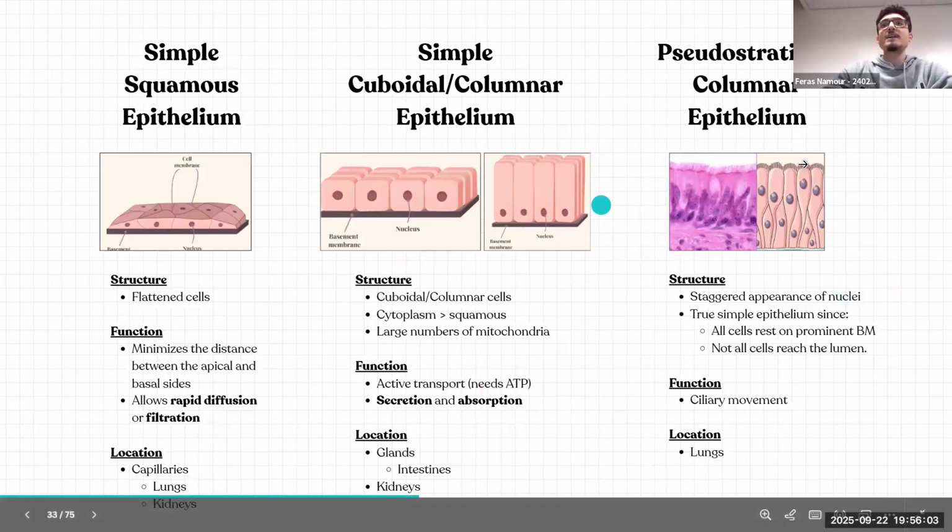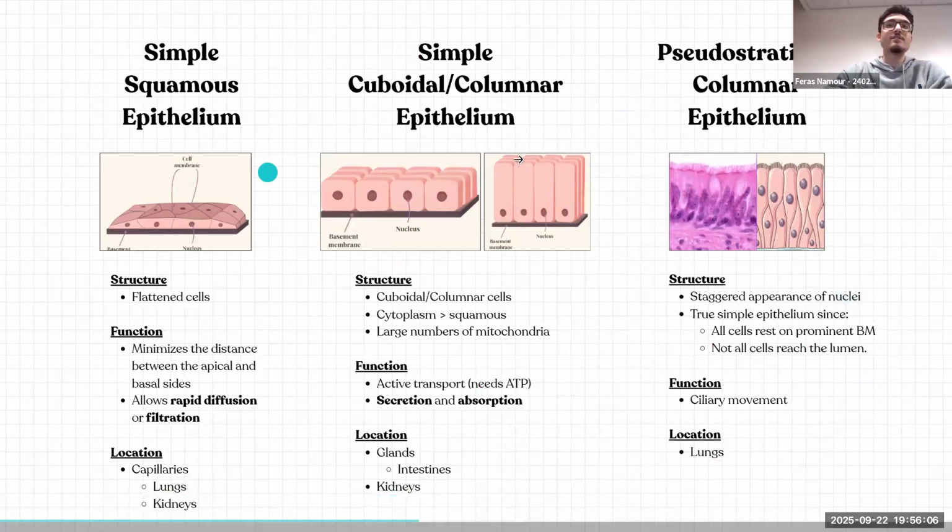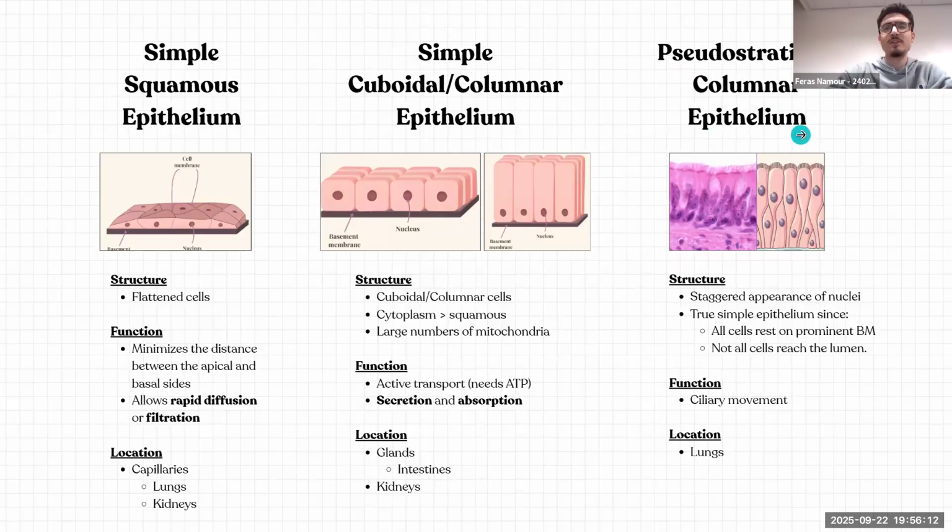Hello. Here we have a comparison slide, and these are our different kinds of epithelium. Simple squamous epithelium, simple cuboidal and columnar, and then we have something called pseudostratified columnar epithelium. All of these look very different, and they look very different because they have different functions.